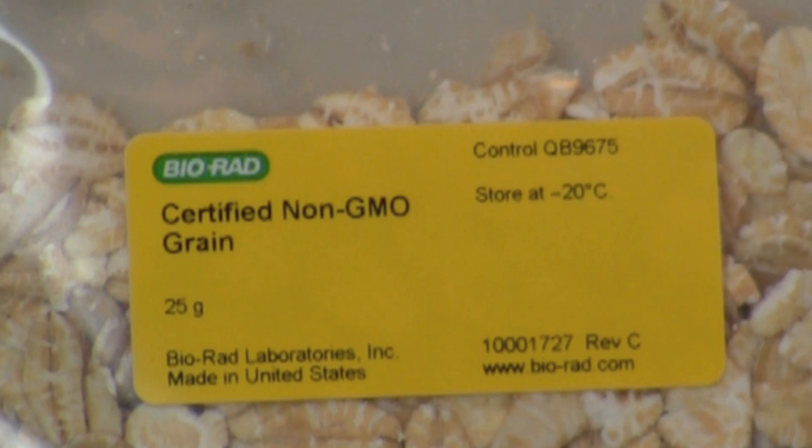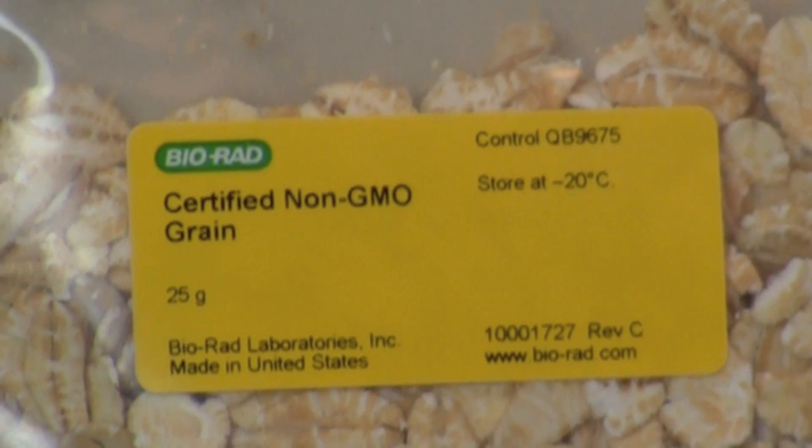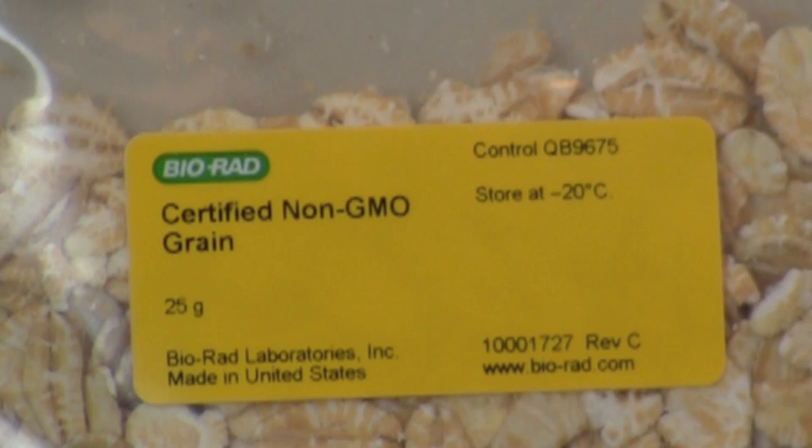Repeat this extraction process using the certified non-GM food. Prior to extracting another sample, it is important to wash the mortar and pestle with soap, wipe it with 10% bleach, rinse it well with tap water, and do a final rinse with distilled water. The mortar and pestle are a potential source of PCR contamination and must be thoroughly cleaned before each use.